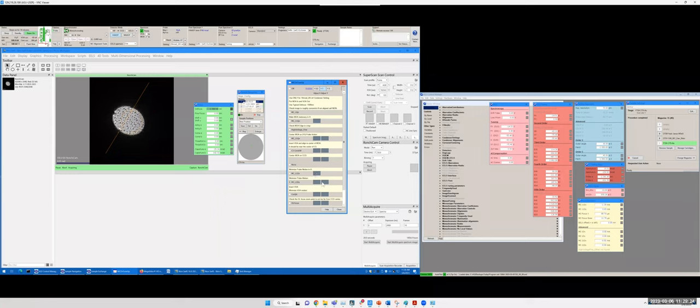Okay, so now we want to address the Y control using this one. We want to minimize the movement in the Y, in the perpendicular direction. You can see if it's exaggerated, right? You can see it's a large movement along the Y. And then we gradually minimize it.